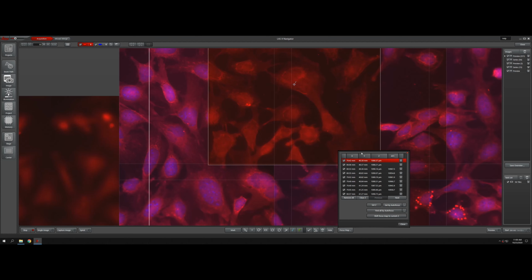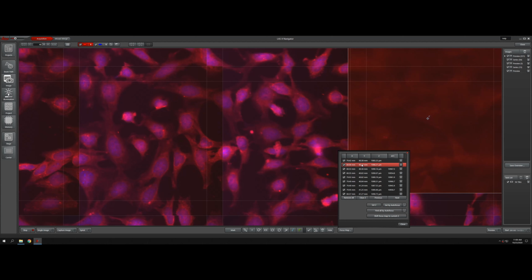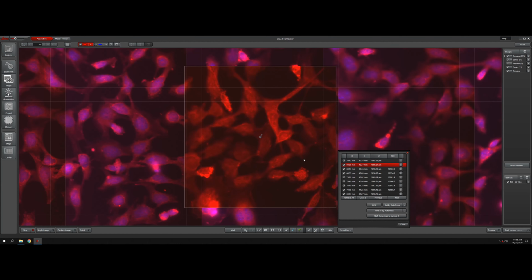I'm refocusing, as you can tell. Okay, set Z. Needs to update. Go to the next one.